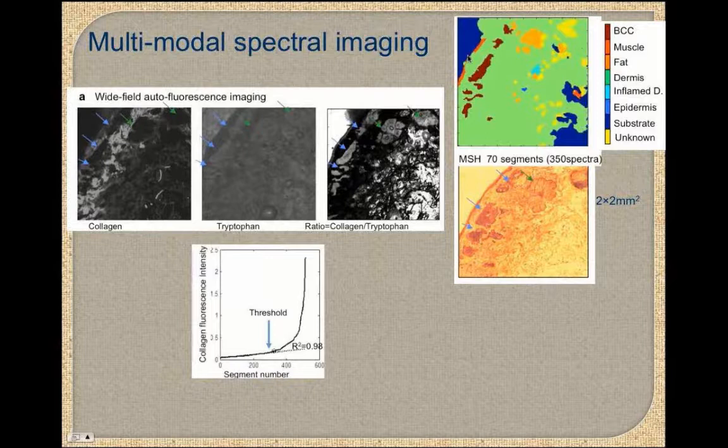And when we do the raster scanning, what we obtain is exactly the same type of map, but this has taken 40,000 spectra, while the previous sampling was only 350 spectra. It shows a speed up of about 100 times faster by selecting the sampling points.